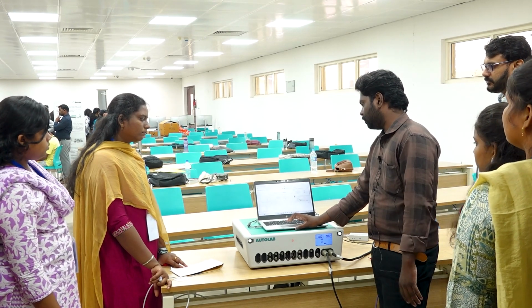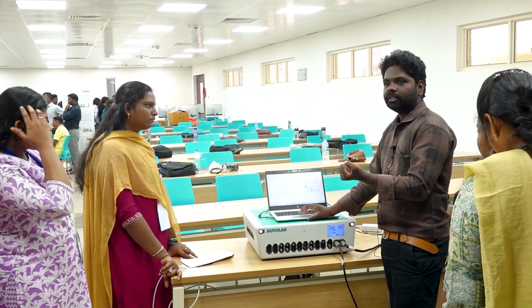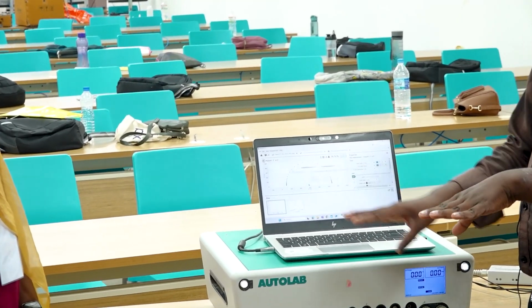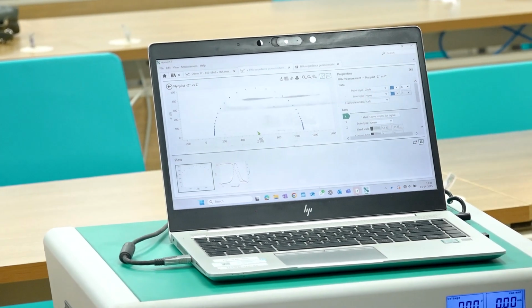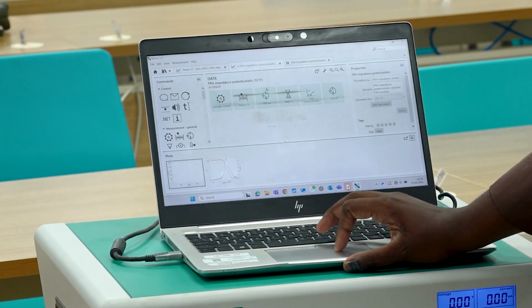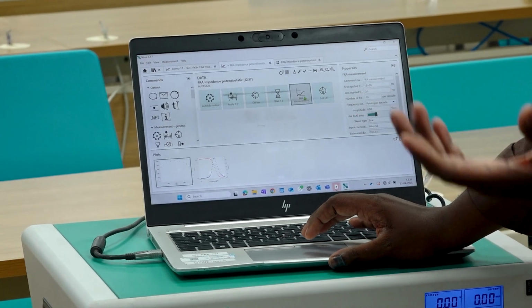Let me go to the first one. This is very easy to understand. Once we understand the basic concept, that will be very useful, because this is just the basics. Based on this, if you approach many data, you will get more knowledge on circuit fitting and EIS data. The first one is this, you first observe it, then we will discuss, right?